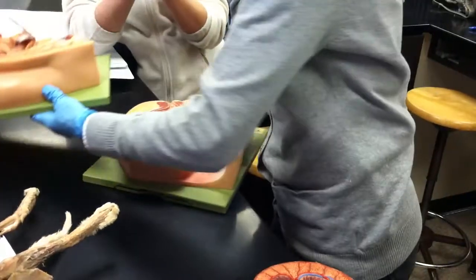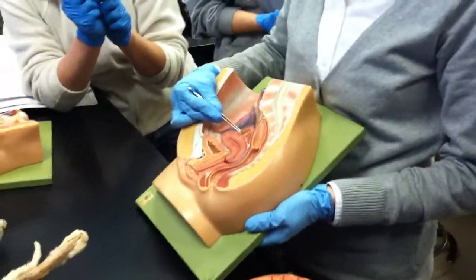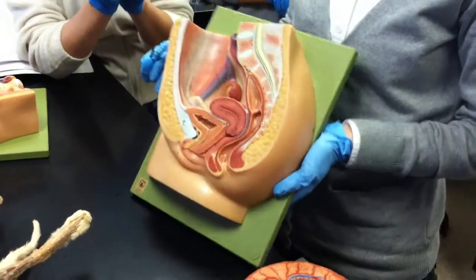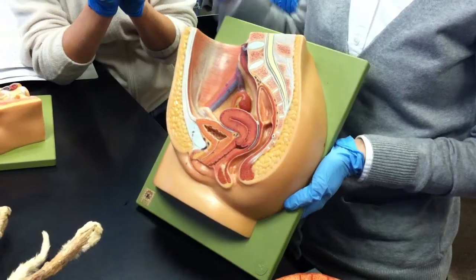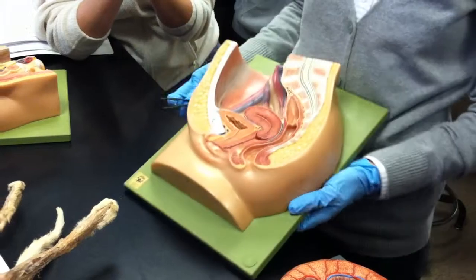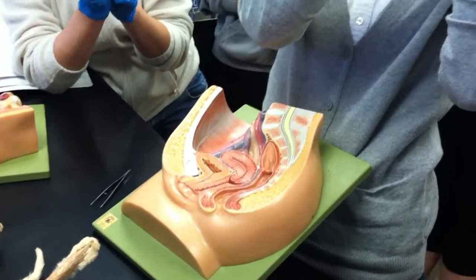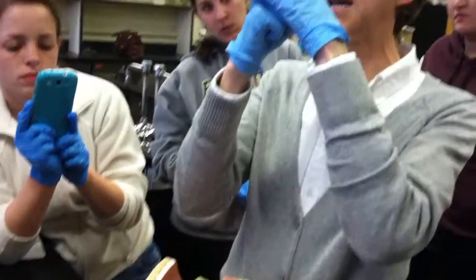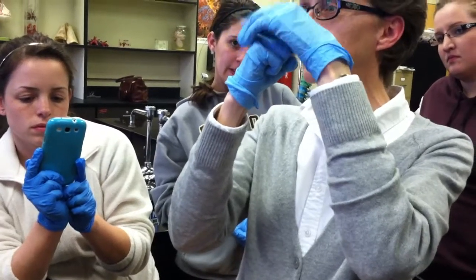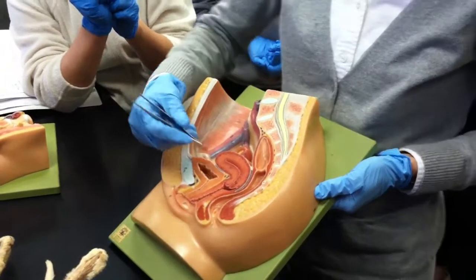Here. And then we have the female. So this right in here, this yellowish piece right there, that is the ovary. This is the fallopian tube here. So you have your ovary, you have your fallopian tube. The fallopian tube has these little feathery fingers called fimbriae. So when the egg is released from the ovary, the fimbriae sweep the egg into the fallopian tube. So fertilization happens in the tube, and then implantation in the uterus.